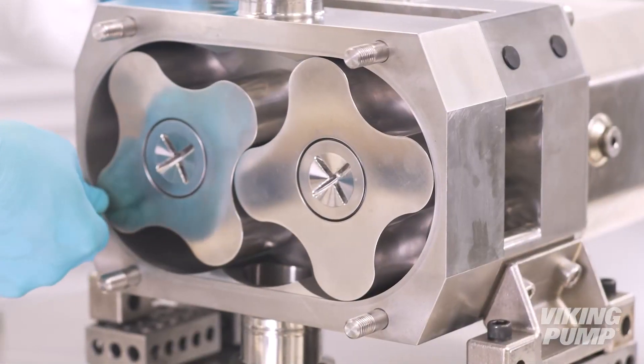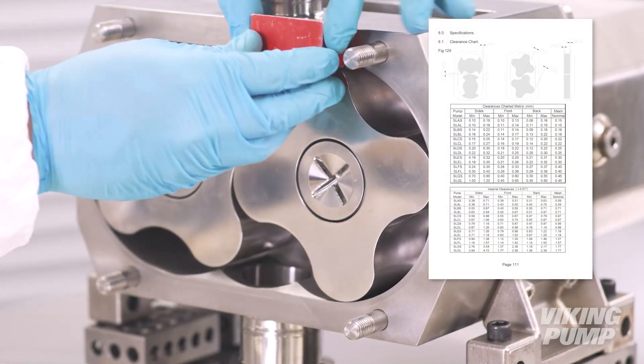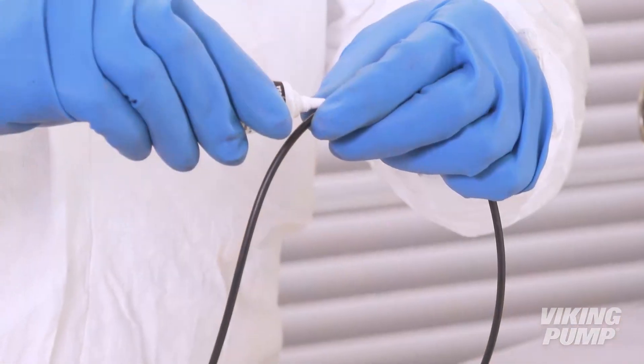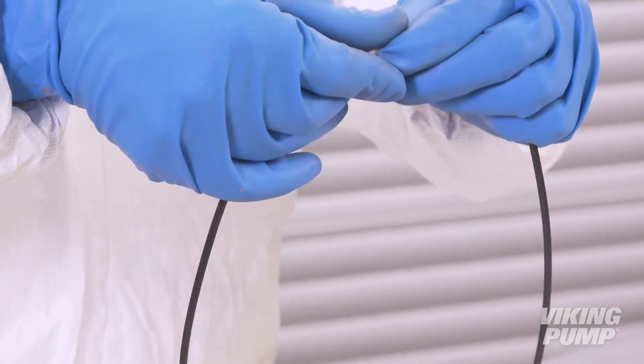Check clearances using feeler gauges and a depth micrometer. Adjust shims as needed and per the recommendations in the service manual. Once correct clearances have been confirmed, lubricate and install the front cover o-ring.